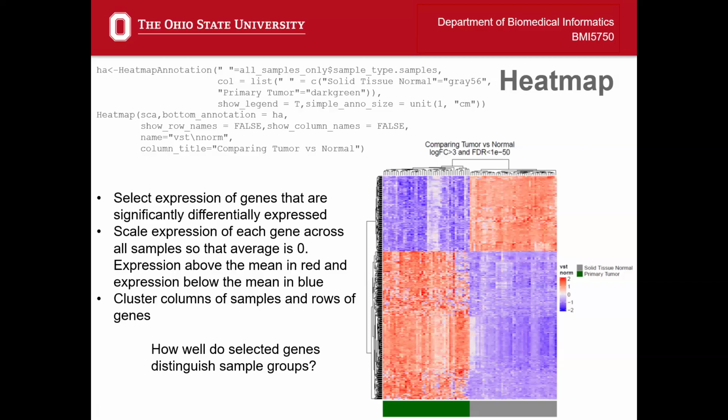And we could plot those, but coloring the plot based on expression would not be meaningful because when you put them all together, it doesn't look good. It doesn't tell us the useful information. We can play around with this later and I can demonstrate it. But anytime you make a heat map, it's going to look more informative if we scale it.